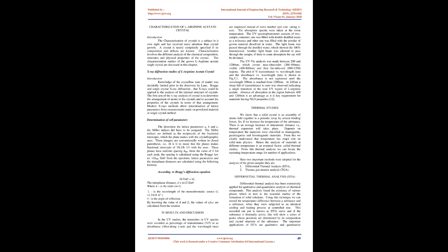Characterization of L-Arginine acetate crystal. Introduction. The characterization of crystals is a subject in its own right and has received more attention than crystal growth. A crystal is nearly completely specified if its composition and defects are known. Characterization involves the different analysis of the chemical composition, structures, and physical properties of the crystal. The characterization studies of the grown L-Arginine acetate single crystal are discussed in this chapter.